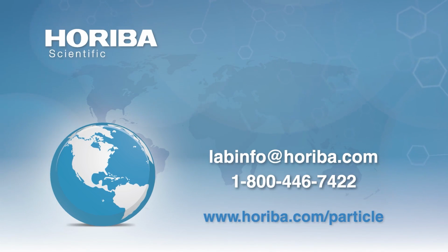So that's one of the other benefits of the line start: you could actually look at the particles that were separated, or you could let two different sizes settle together and look at the two of them together. So you actually are getting a separation of the particles by size in addition to getting the size of the particles. Thank you, Mike.